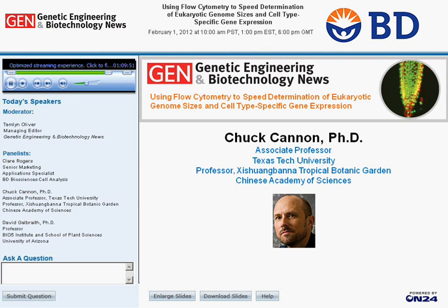Yeah, I'd like to add to that. There is a paper in Cytometry last year from an Australian group in which they described automation using a bead beating approach, I think, to homogenize the tissues, but they were working within a single species and a single tissue type. So it can be adapted in that way, but Chuck is exactly right that different specimens, different samples will require personal optimization. Okay, thank you.